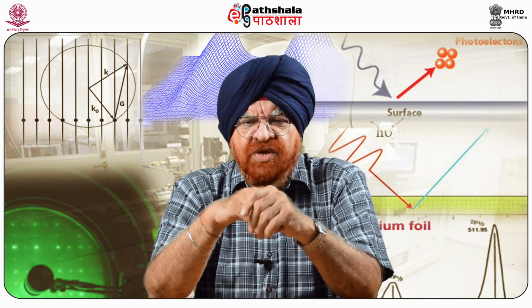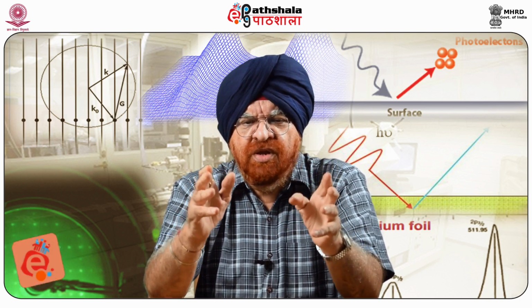We covered the basic principle of CFM, some examples of its applications, and theoretical models that provide the basis for understanding the experimental results. We can emphasize the application of modern kinetic theory of non-covalent interactions to the analysis of CFM data, which is pretty important in order to understand these two relations.